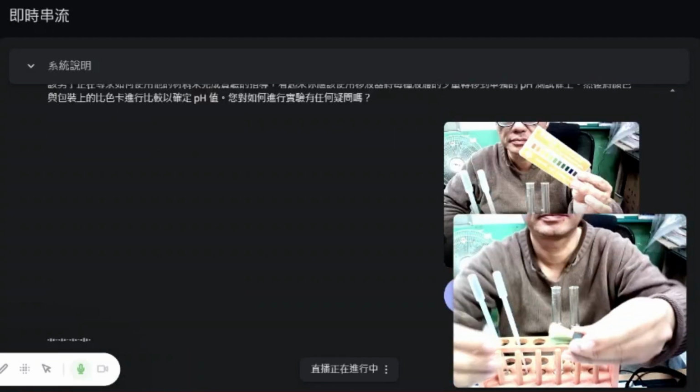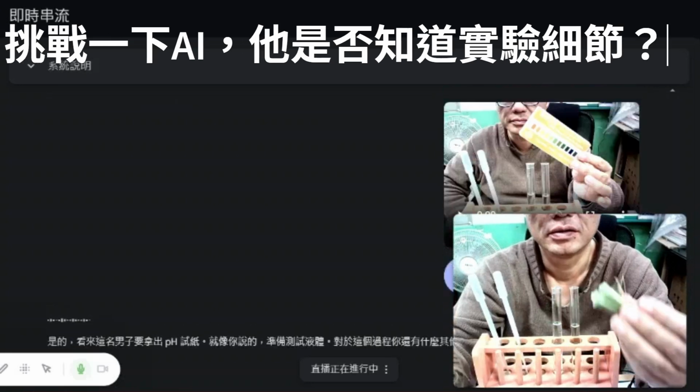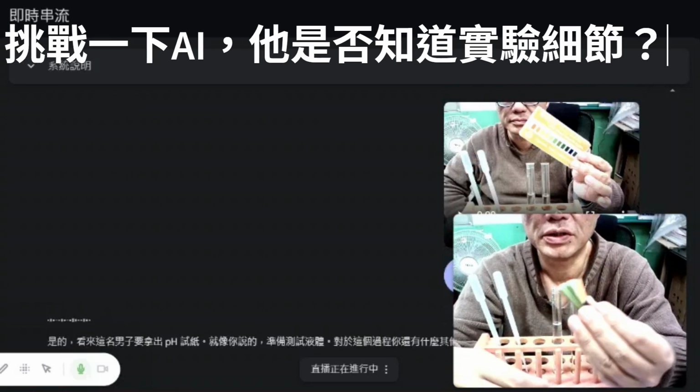Yes, it appears the man is going to take out the pH test strips, like you said, to get ready to test the liquids. Do you have any other questions?